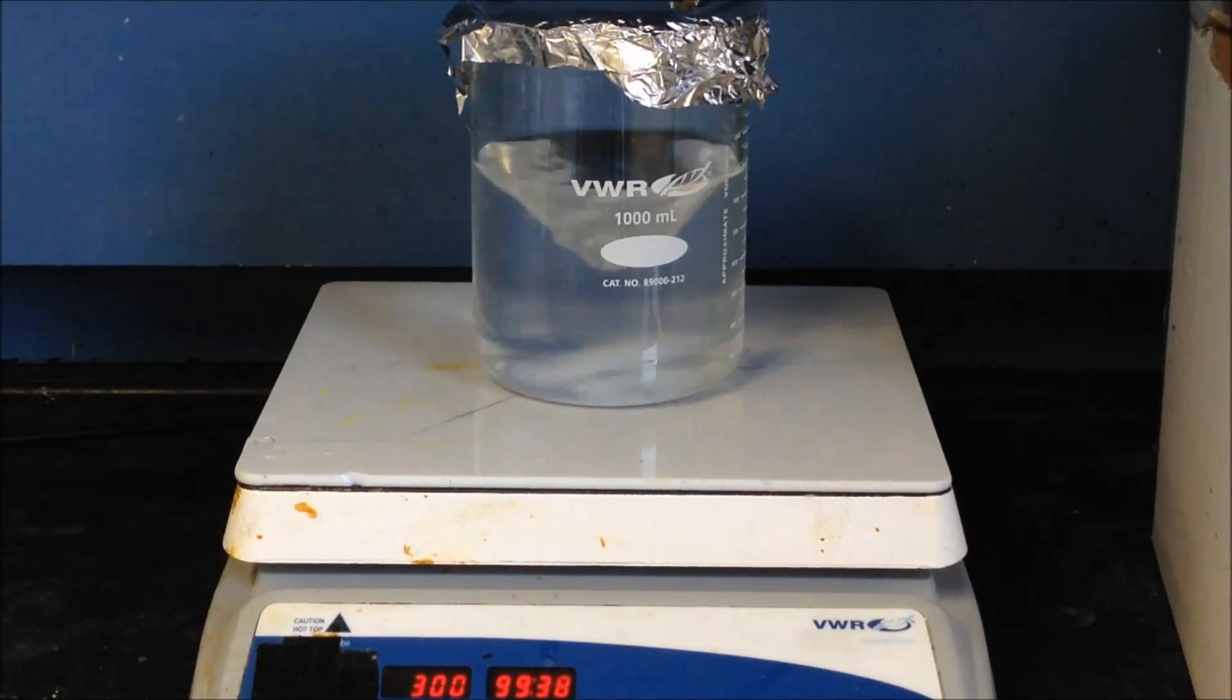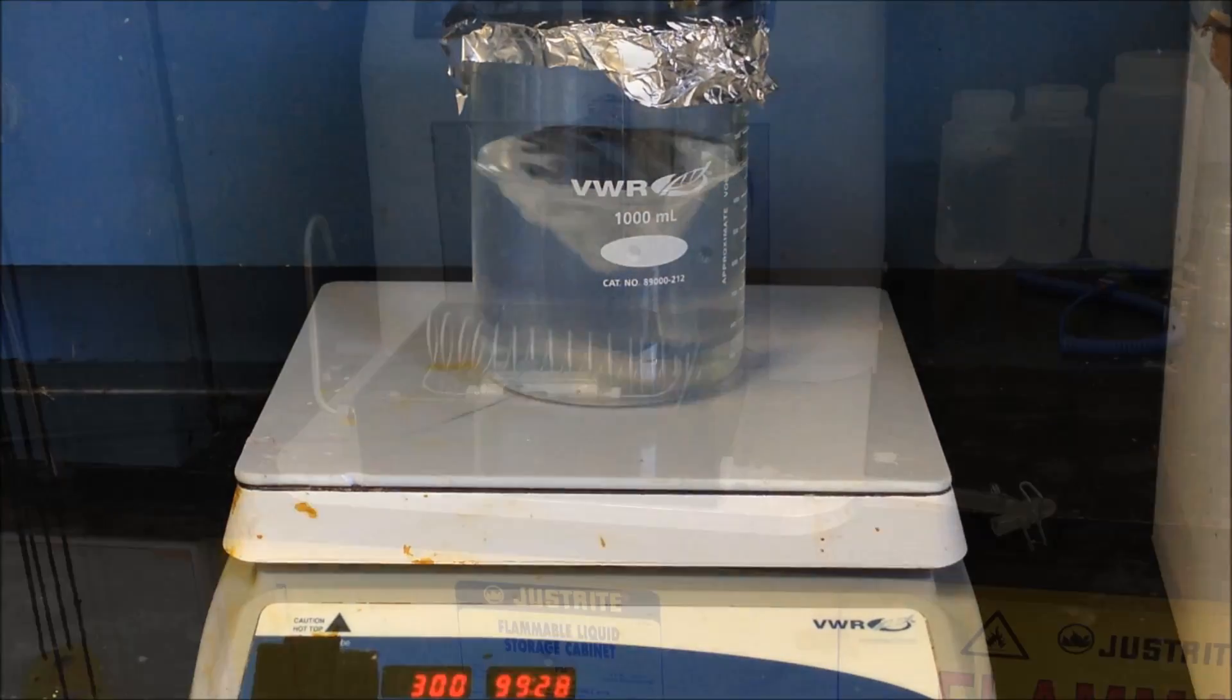To start, the PVA must be dissolved in the deionized water. To facilitate this, the material is mixed and then heated to 80 degrees Celsius. Once the water phase appears transparent, the PVA has been dissolved and the material is then cooled back down to room temperature.